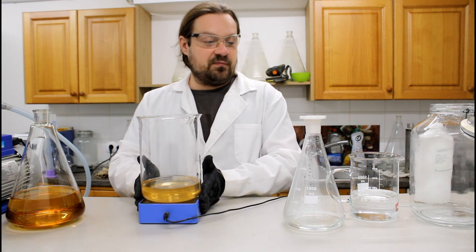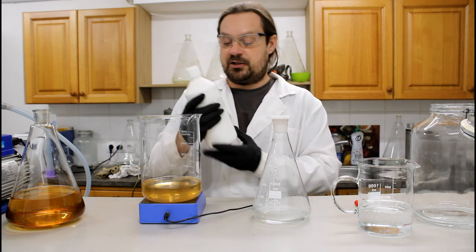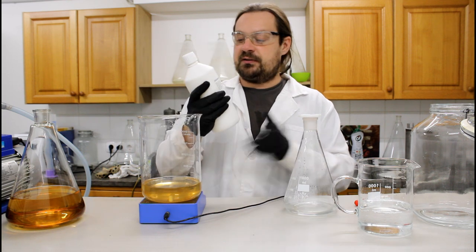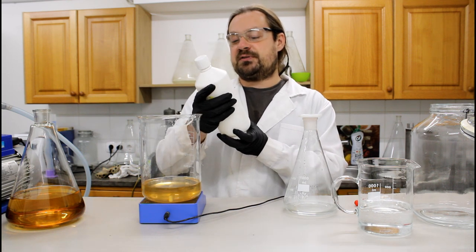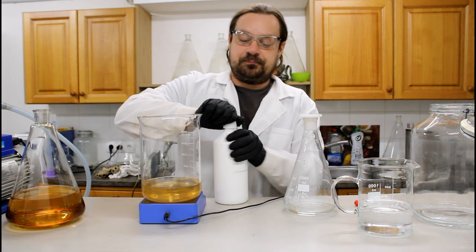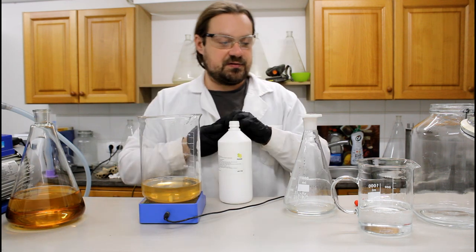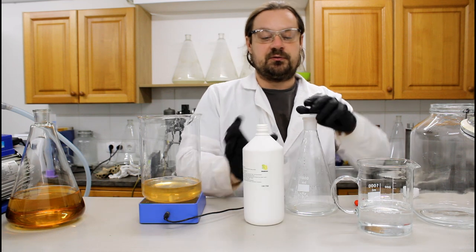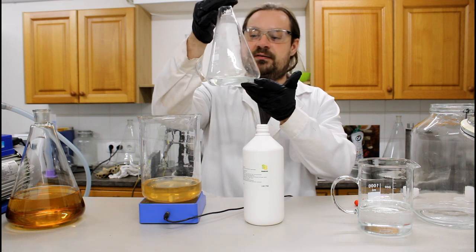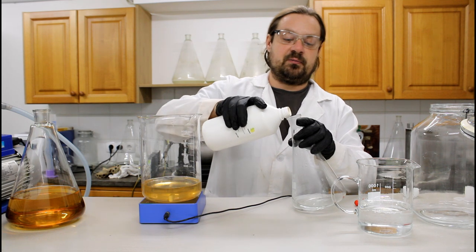So now in the next step we have to prepare our acid to lower the pH. I'm going to use hydrochloric acid. This is 37% hydrochloric acid, so it's strong. We don't need it so strong, so we are going to dilute it down a little bit. Here is already a little bit diluted hydrochloric acid inside. So just making a little bit more.